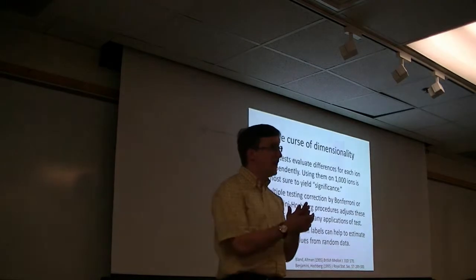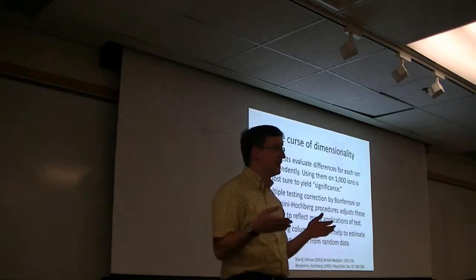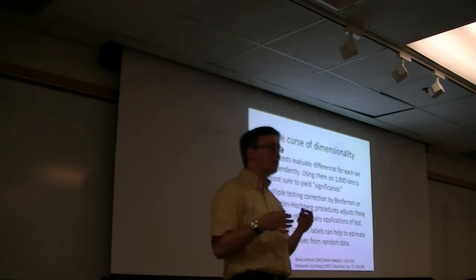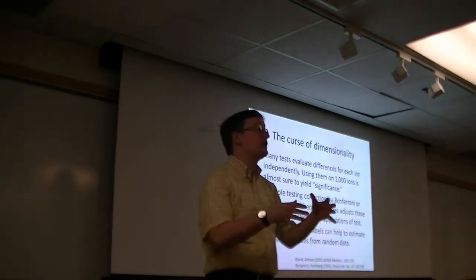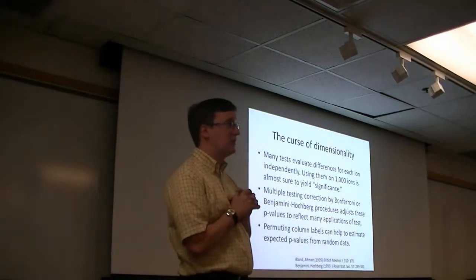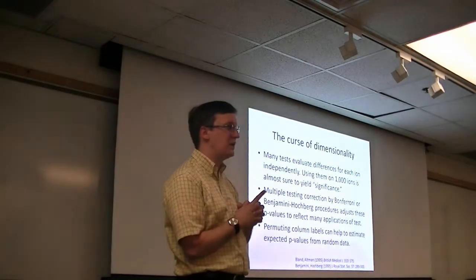Now we see that the scale at which people are practicing systems biology is always increasing. The number of samples that we see in tests is no longer, say, 3 versus 3. We frequently see even more than 100 samples being thrown together in some of the big systems biology profiles. That helps. But I would also note that the number of entities that we're measuring in our experiments is always going up.